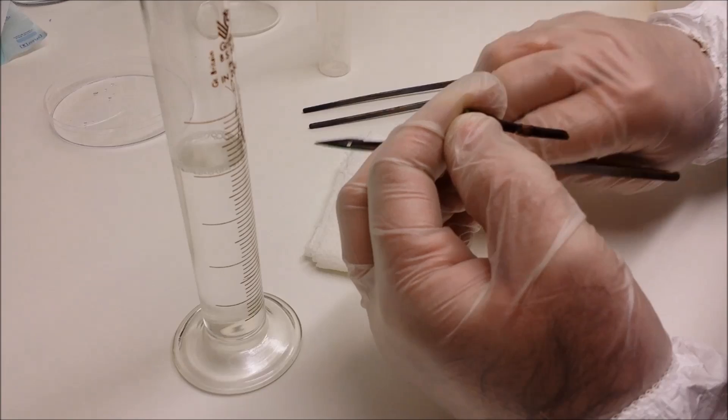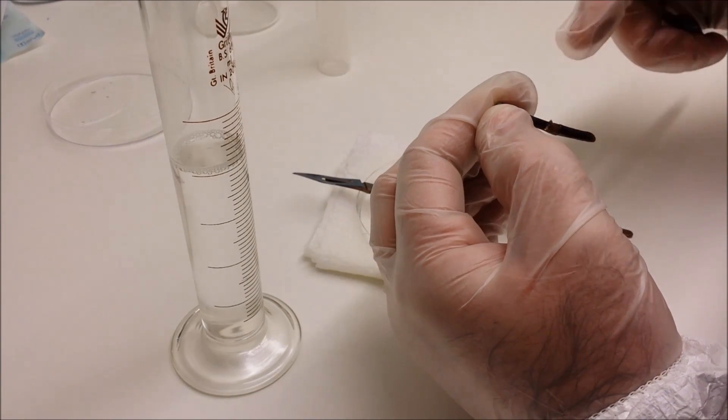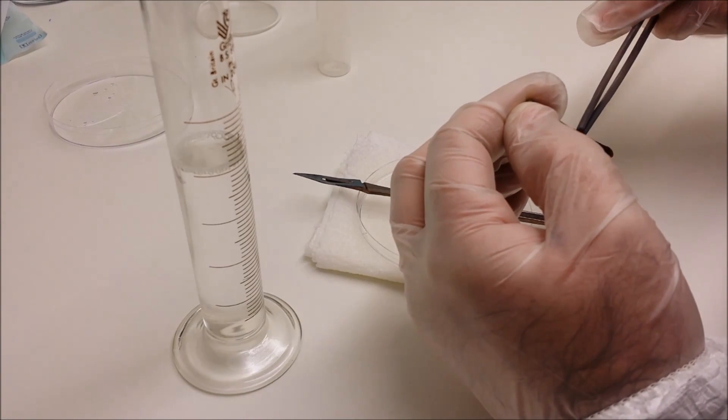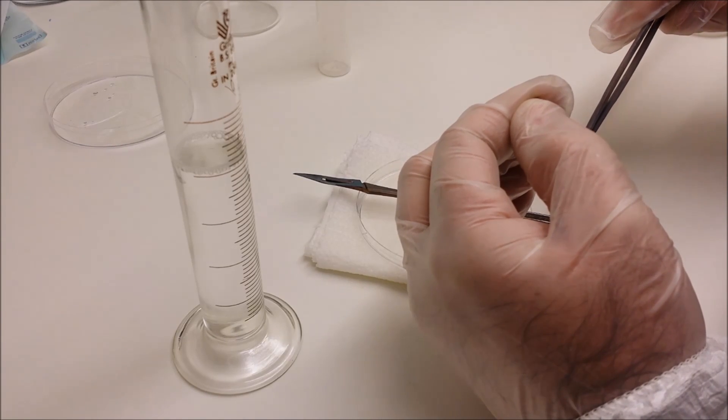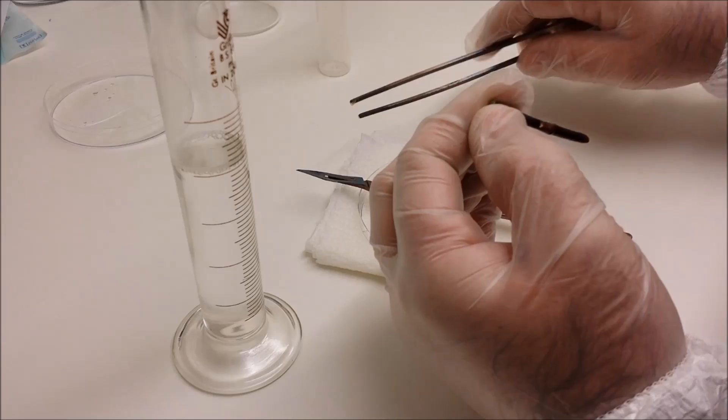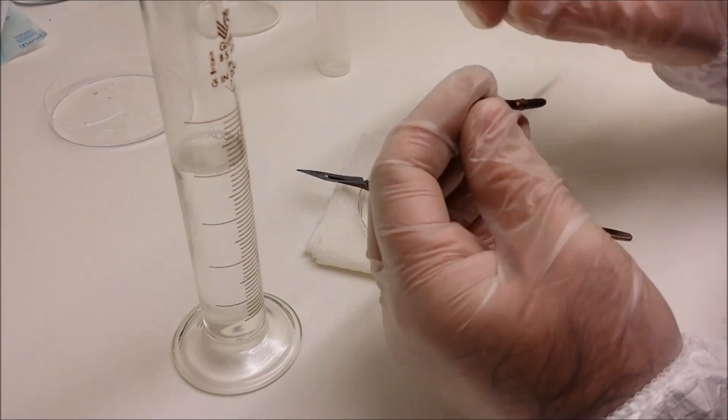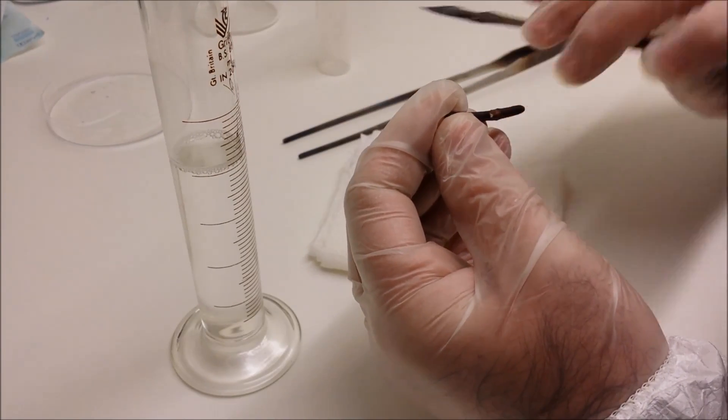So carefully peel back the sheath without disturbing the bud underneath, and here I'm using tweezers just to prise off the loose bits.